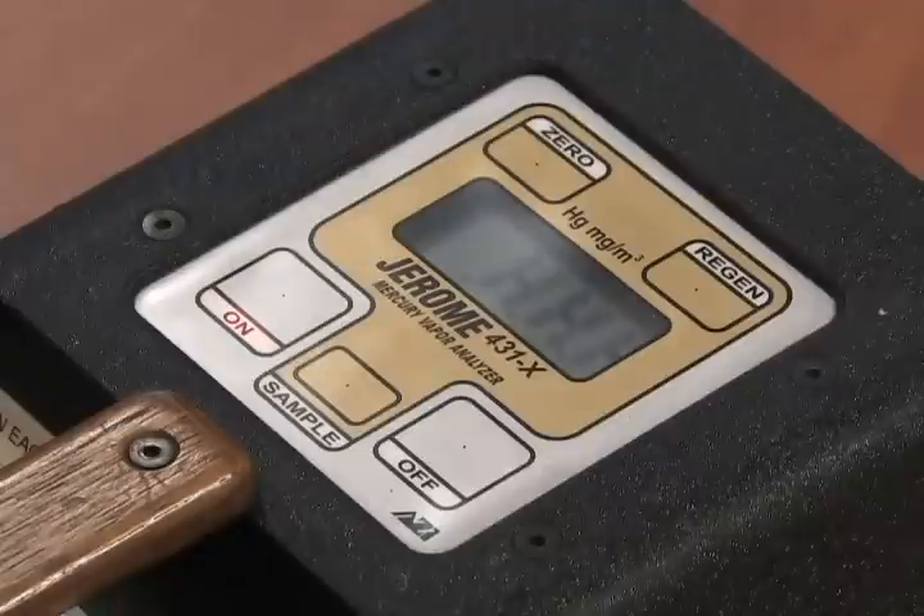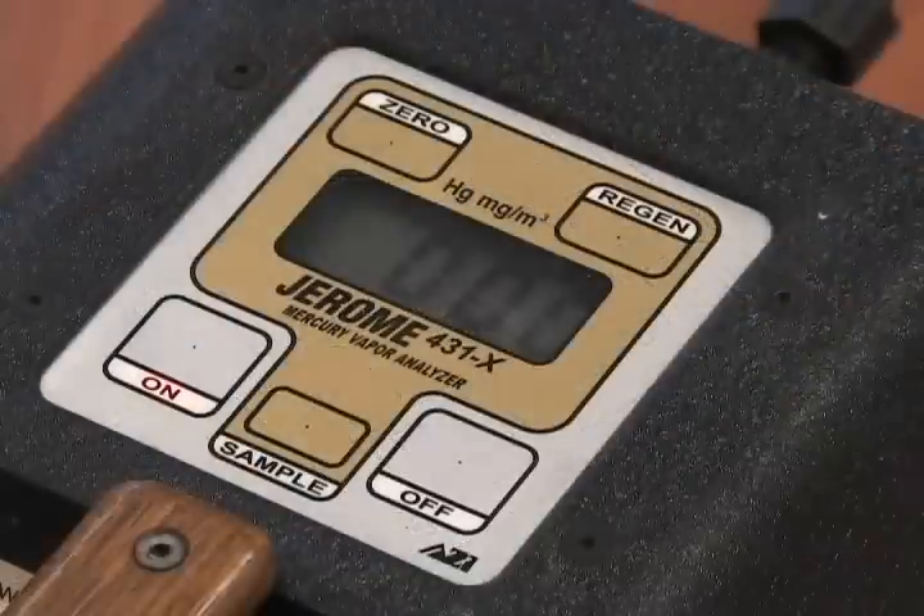Regeneration takes approximately 15 minutes. When HHH stops flashing, the sensor has now been regenerated. Turn the unit off.